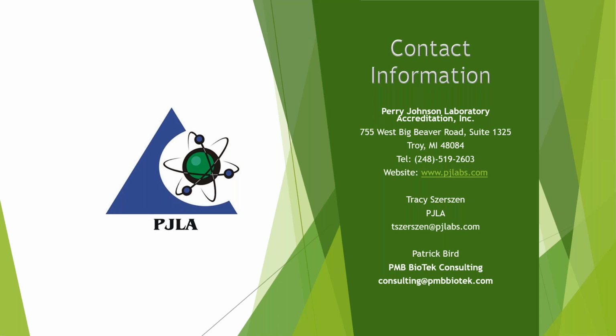If you're looking at a method that has maybe a little bit more in-depth extraction protocol and they're using magnetic beads as part of it, or there's multiple extraction steps, from that standpoint, it's really investing more in the labor you're using to run the method. Those types of methods tend to have 30 to 40 steps versus 5 to 10 for a simplified method.